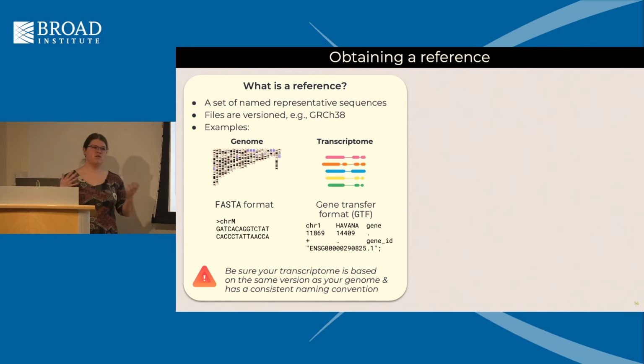These names have changed over the years. The naming convention recently changed. So if you see stuff with HG19, that is quite a bit older. That reference sequence is about a decade old and occurs before this naming convention changed.